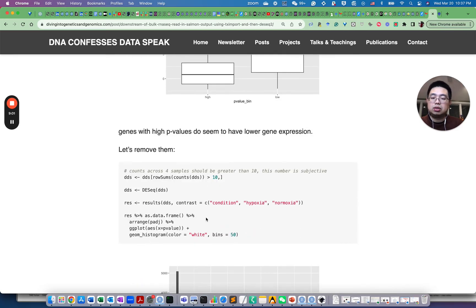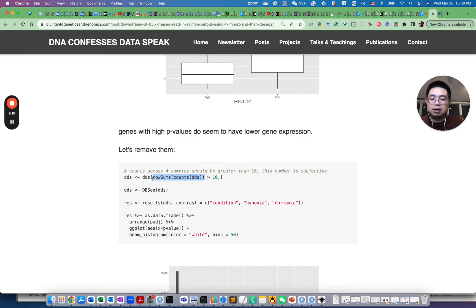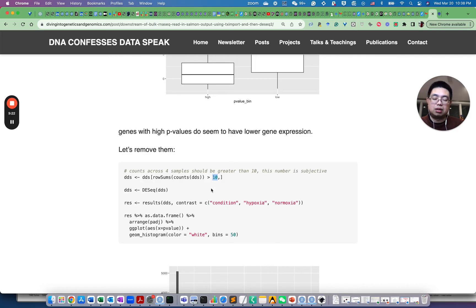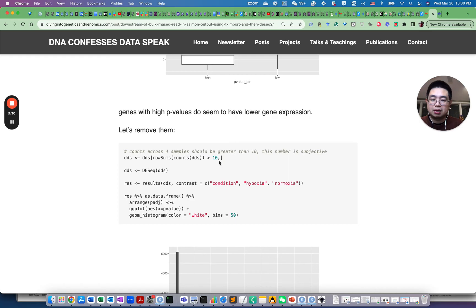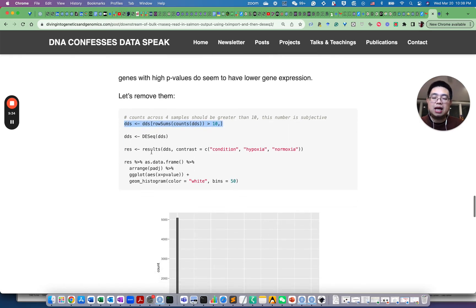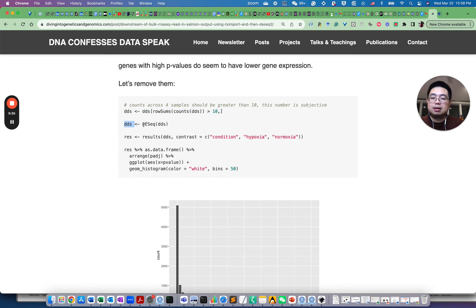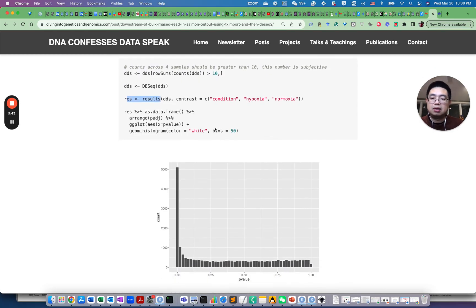So what we do is that before we feed it into DESeq function, we actually use the row sums accounts DDS and then get the sum of the counts for each gene. And we only, we filter out those genes that are smaller than 10 counts. So this is a little bit subjective, the cutoff here. But this is what I use. And then we run the same code, DESeq and DDS, and then results function to calculate differentially expressed genes. We plot the histogram now.